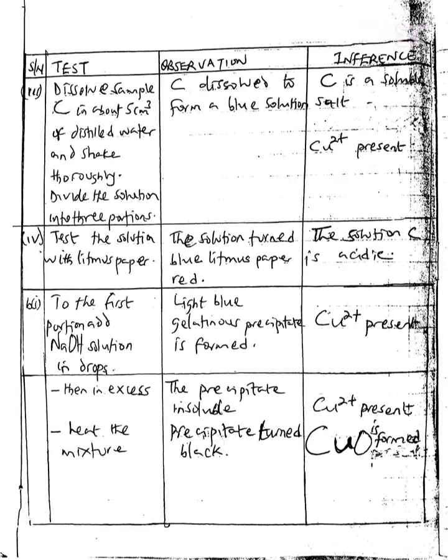You are welcome to Science Planet channel, and today we are looking at salt analysis, that is qualitative analysis, and the salt we are looking at is copper(II) tetraoxosulfate(VI), that is CuSO4. And remember, it is our predicted NECO question, which will be coming up tomorrow.